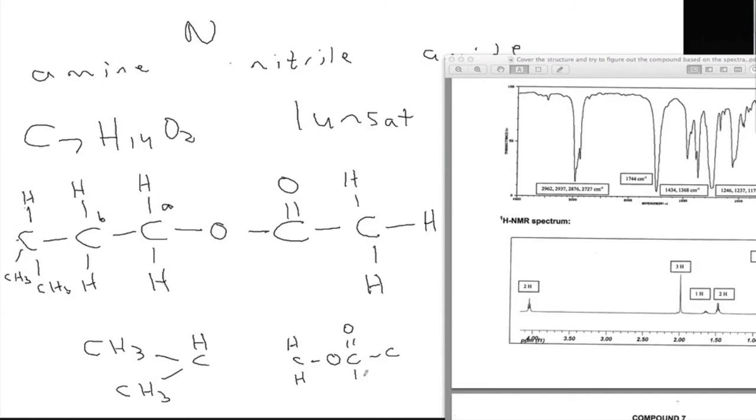And you can also ask which is this carbon. And then we could do even more because this had nice splitting. I think this is one problem. I don't think you were getting your two CH2 groups connected to each other. But if you work outwards, it's pretty clear that they're connected to each other because this has very nice splitting. This triplet has nice splitting that lets us work out this. And the other thing that you weren't quite using is that because this is a nice singlet, it's probably connected to the carbonyl on this side, and also because it's pulled to the left.